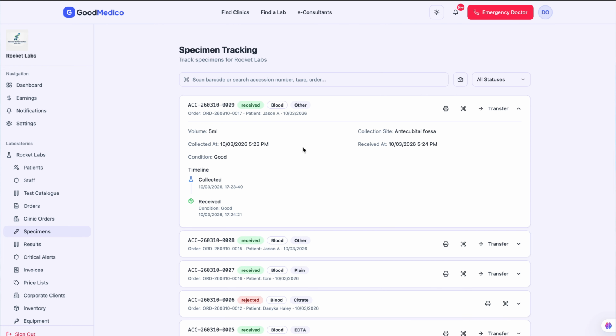This is it. Now at this stage, we need to transfer it for chain of custody, which means we are simply going to send the specimen from yourself to another person or a department, either within the same lab or another location that will do the actual testing that was ordered using the specimen that was provided.